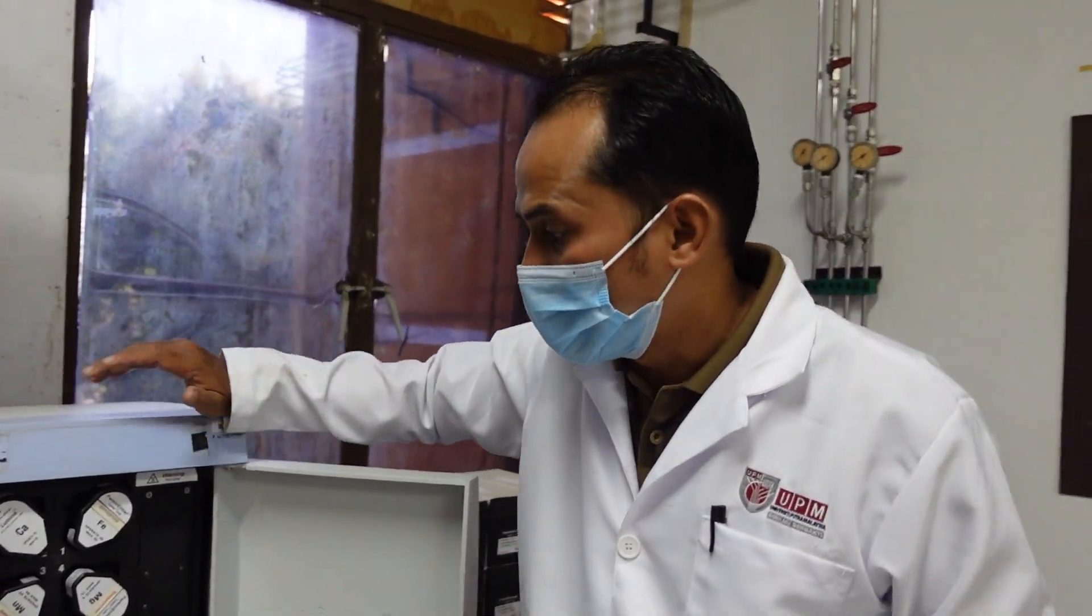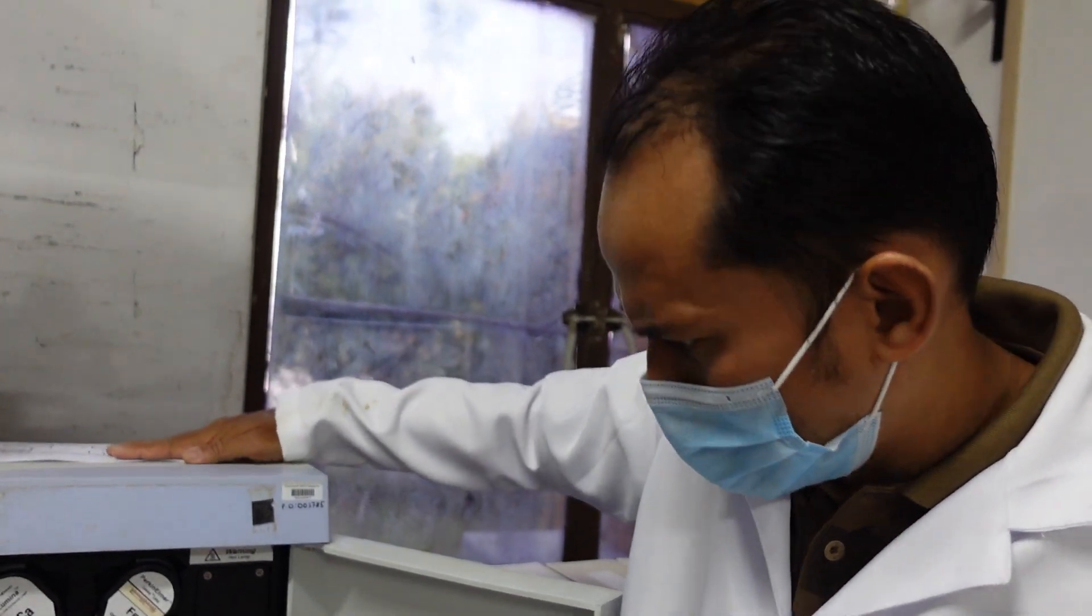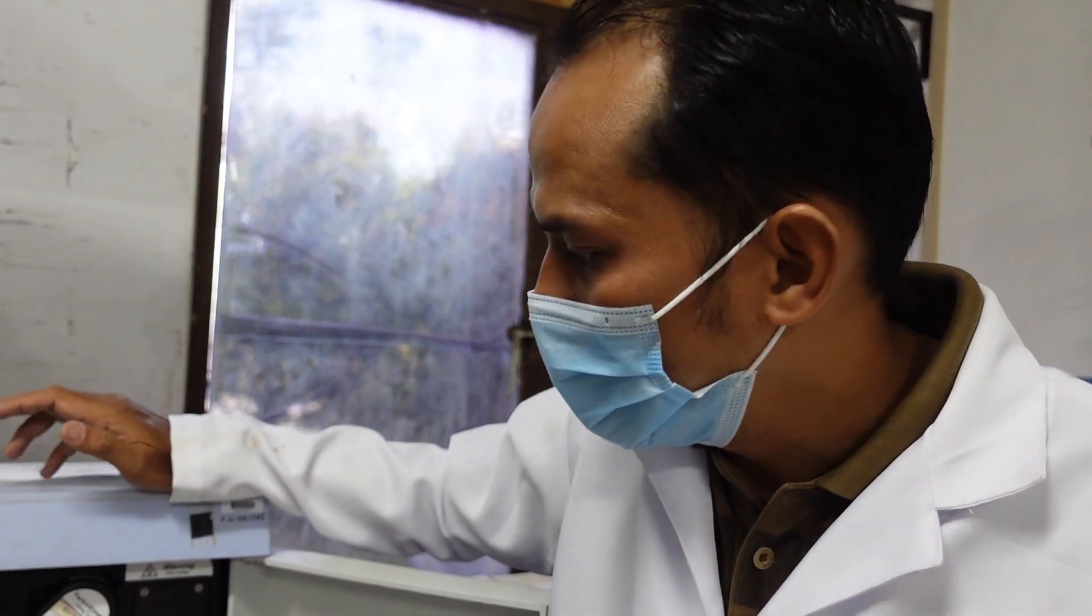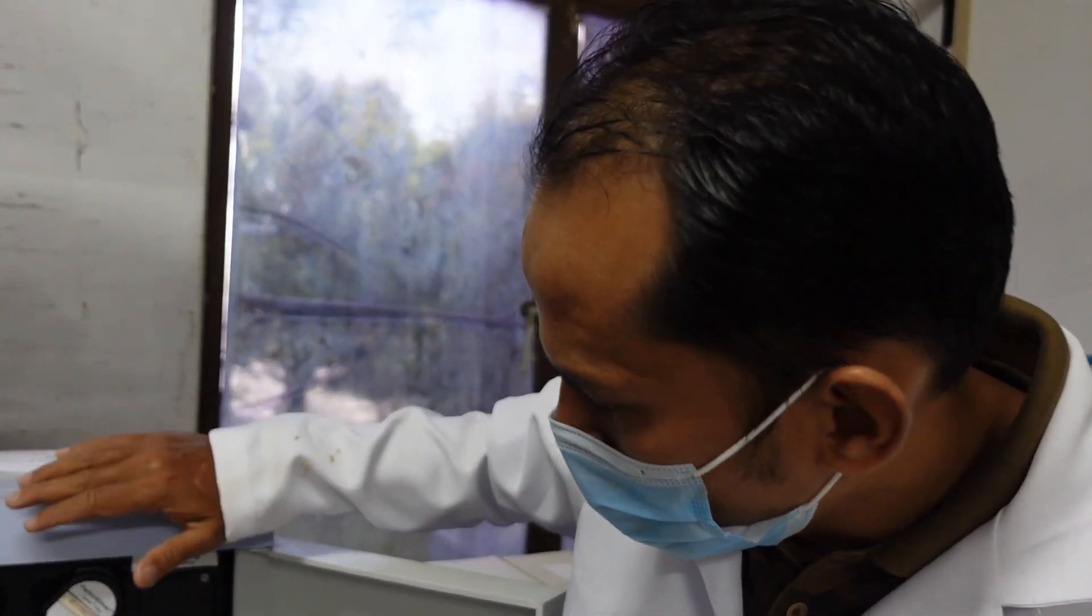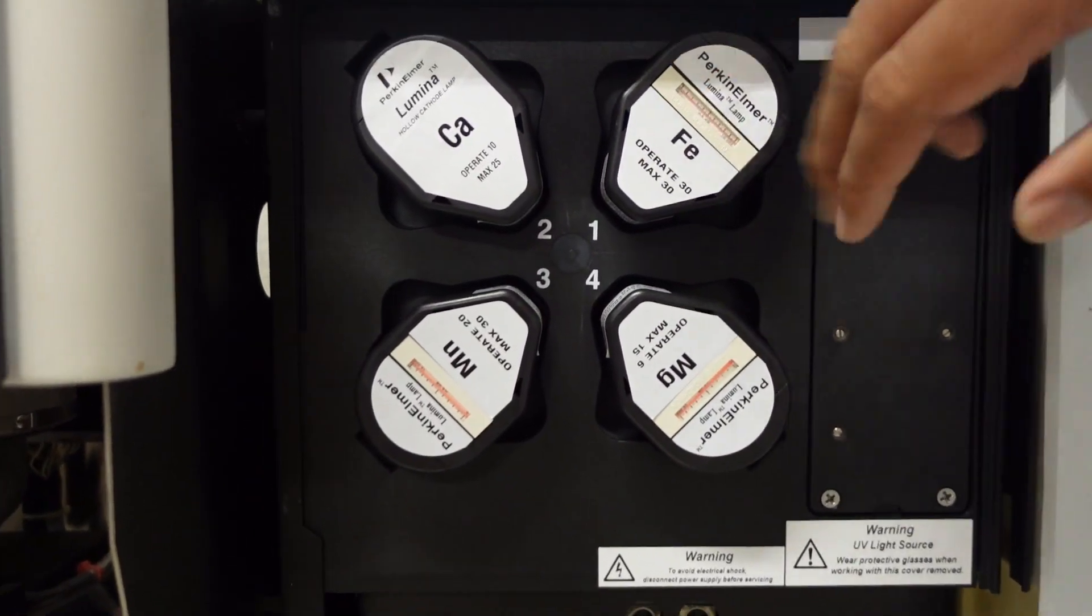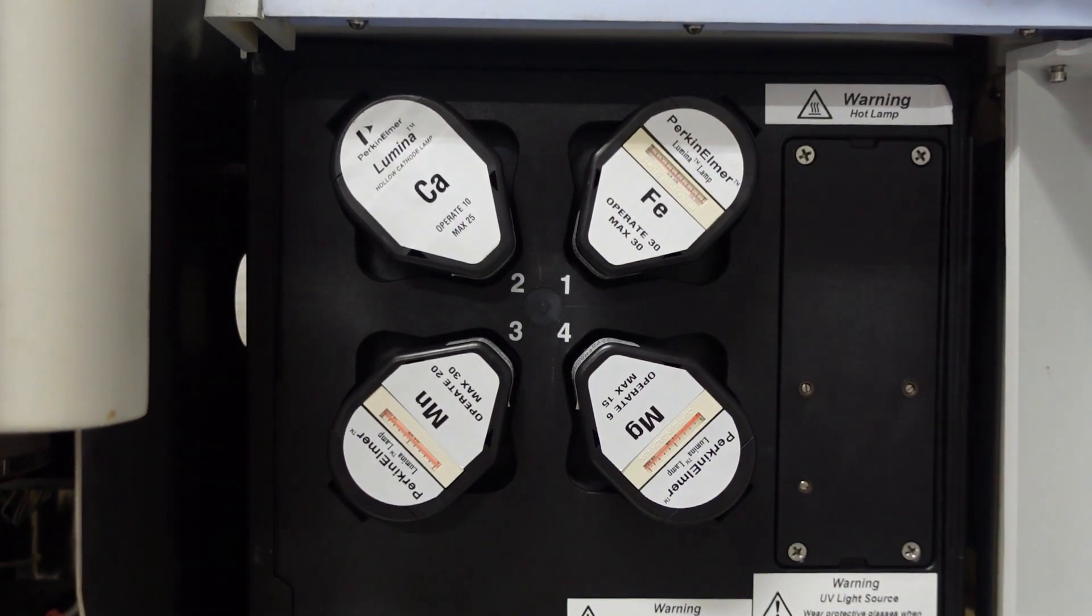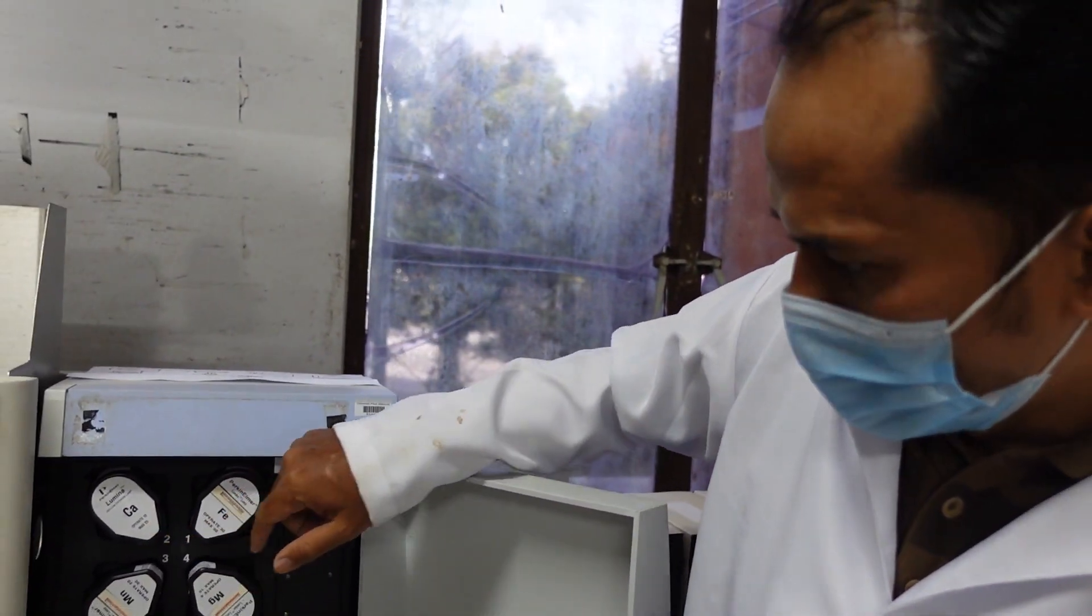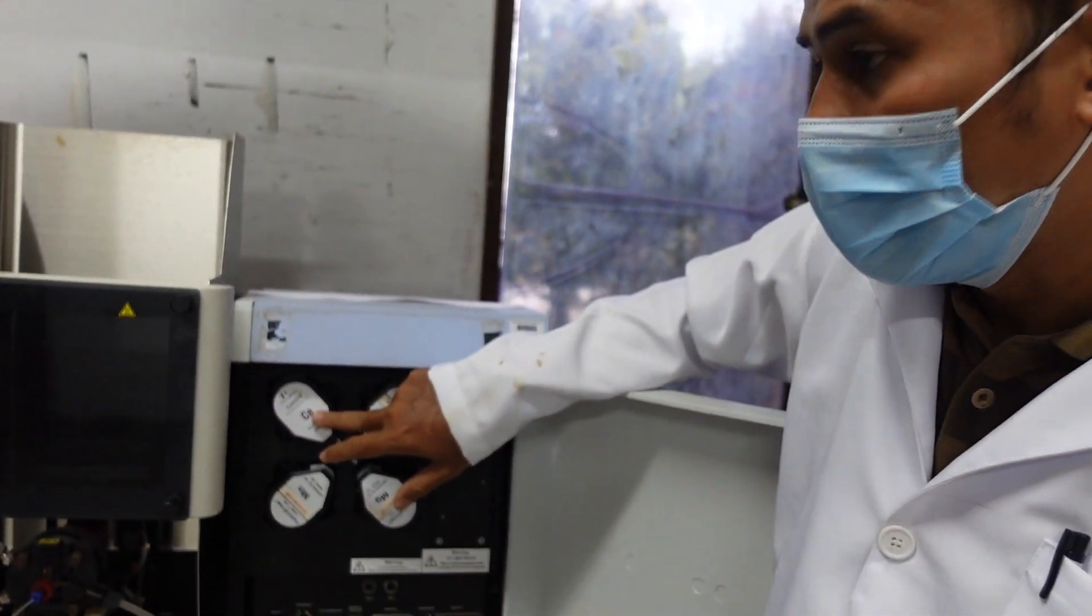Let me show you the lamp first. In AAS, the lamp is one of the most important elements. You need to have a specific lamp for the specific mineral that you want to measure. Here there's four slots. These are all interchangeable lamps. We have calcium, manganese, magnesium, and so on. For today's experiment, we're going to do calcium. I will explain about the lamp in the lecture.